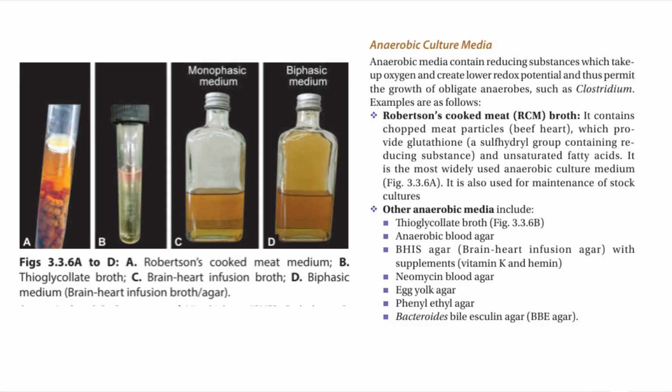Now, what about strict anaerobes, like Clostridium, that absolutely hate oxygen? If you look at this tube filled with what looks like chopped meat particles, that's exactly what it is, Robertson's cooked meat, or RCM broth. It's the most widely used anaerobic medium out there.